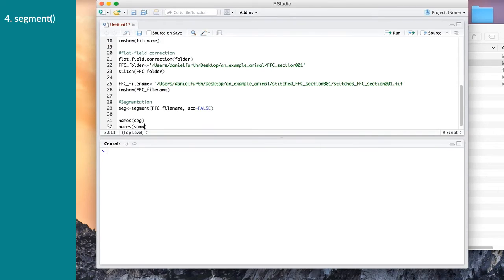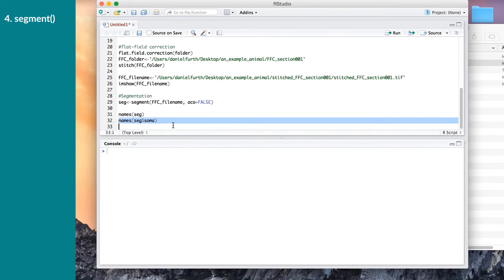Let's look at the Soma. So this is actually your result that you have segmented now, the cell bodies. So the Soma object contains basic information like the X, Y pixel coordinates of the centroid of the Soma, the intensity in fluorescent intensity average, and the area. All of these results are there for you, for example, to plot as I'm doing now. So now I'm going to plot the position of each neuron in X and Y coordinates in pixels.